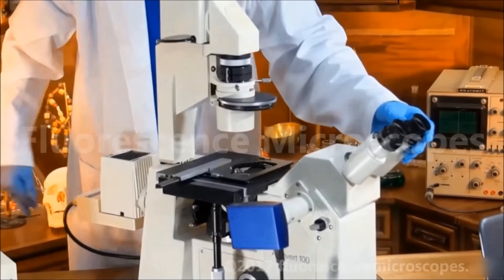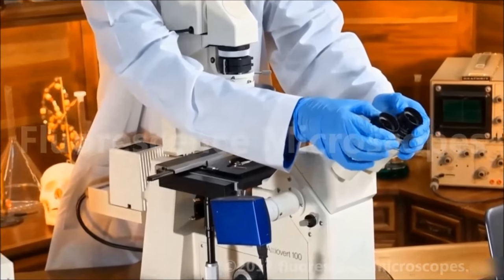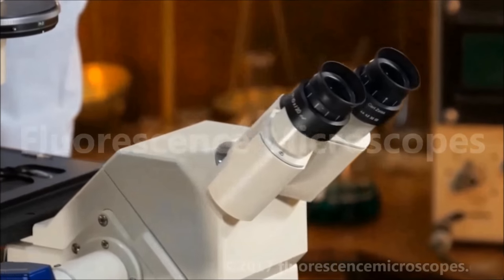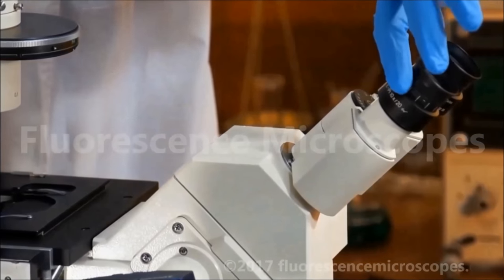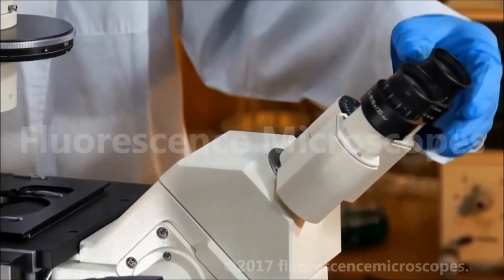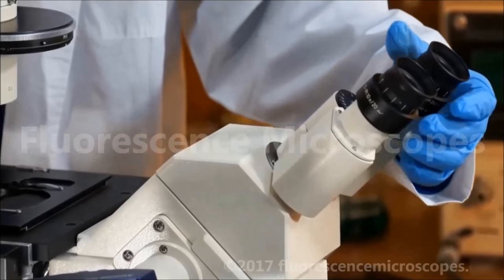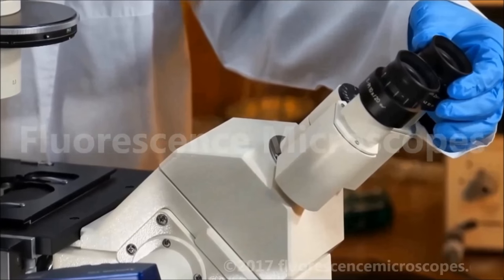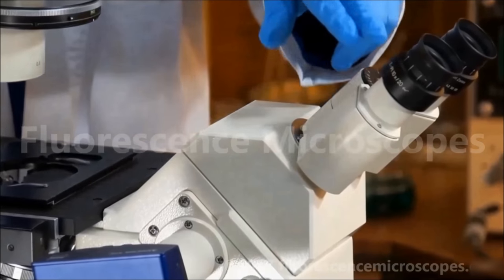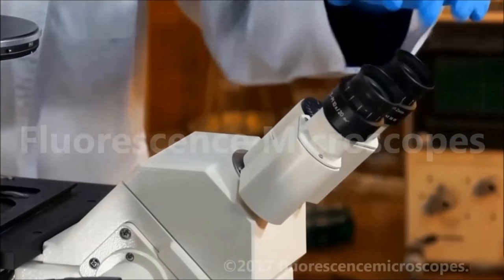You have diopters on the eyepieces, both eyepieces. This is to synchronize both eyepieces so that they're in focus at the same time. Each person has a little different setting, especially if you wear eyeglasses, so you may need to adjust it a little differently. But if you look into the eyepieces and one of them is in focus and one is not, just use the diopter on one or both.